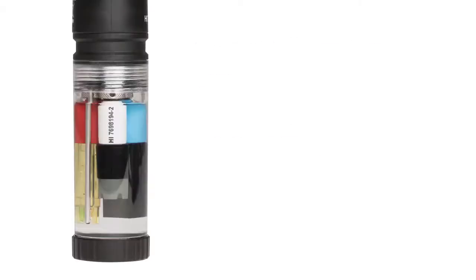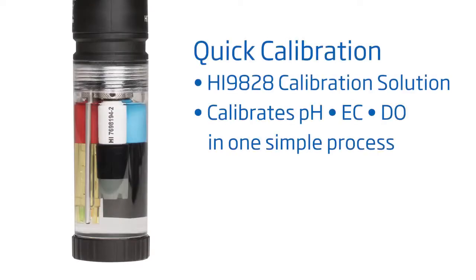Calibration is an important step to ensure the most accurate measurements. We recommend calibrating before each use. Although you can calibrate each sensor individually, in this video, we'll do a quick calibration. Quick calibration is a great way to calibrate for pH, EC, and DO all with one process.